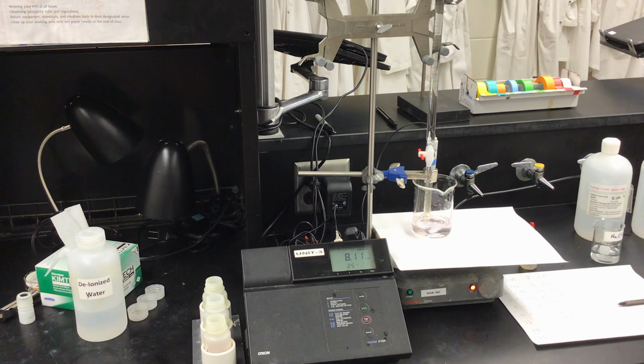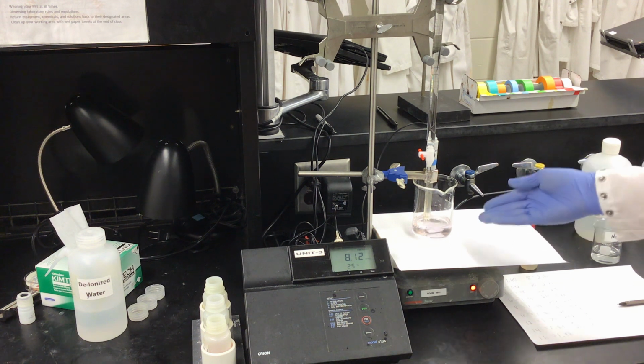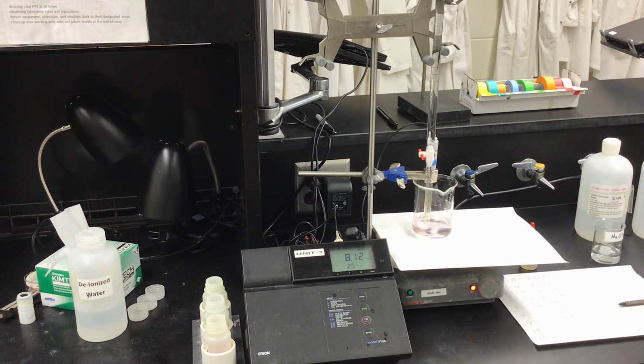If it does, that means we are not at our endpoint. If 20 seconds passes and we still have pink, that means we are at our endpoint. Based on the pH meter, this would make me feel that we are at the endpoint, since our indicator turns pink in the presence of base, not necessarily at a pH of 7, which would be the neutralized point of our solution.